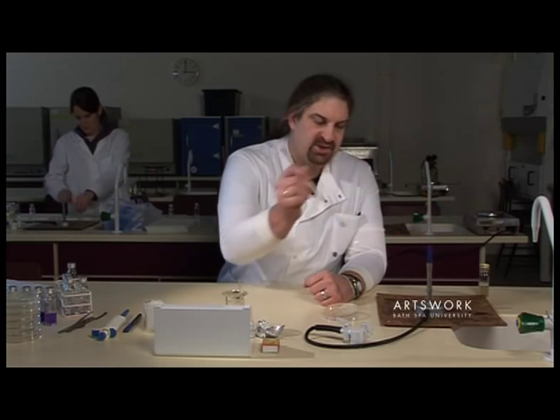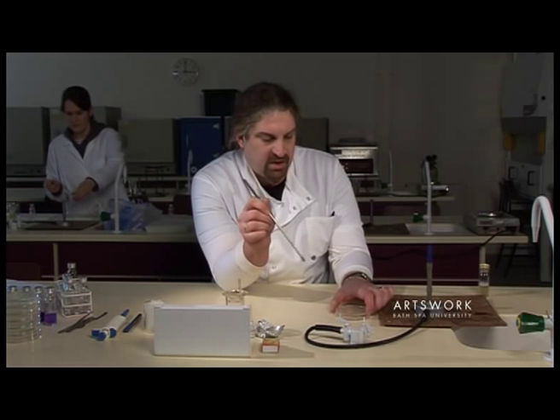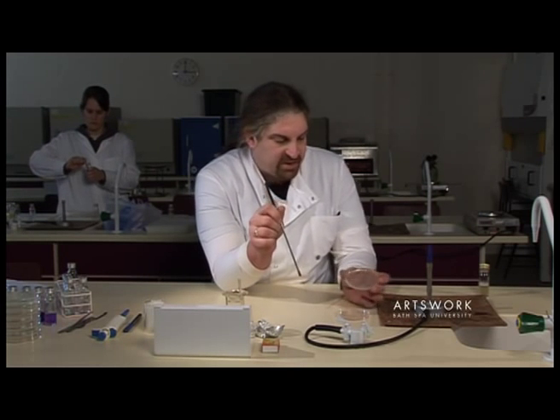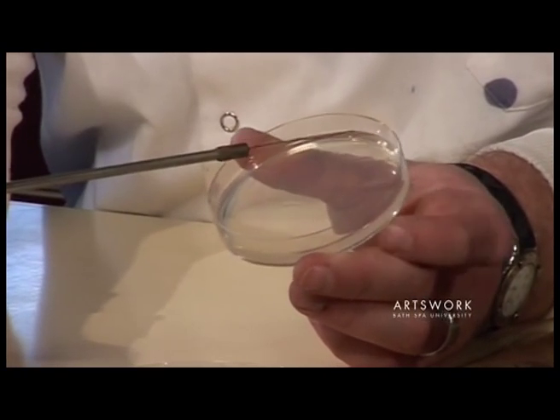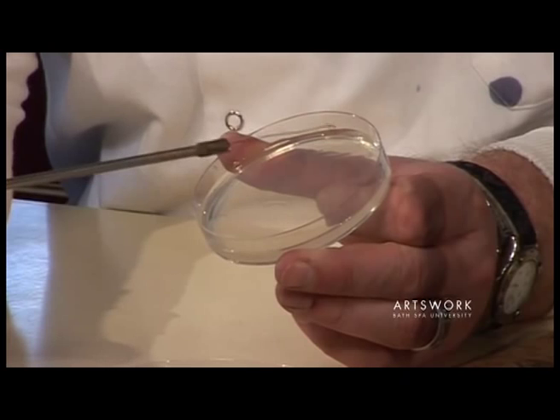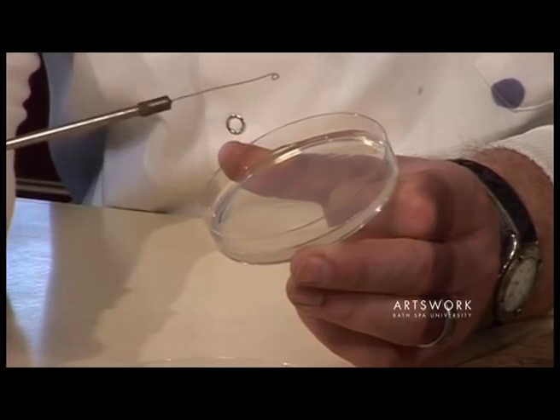Once we've done that, sterilize the loop again. Turn the plate and this time draw the streaks out from where the first set ended. Exactly the same principle—four or five separate streaks going away.